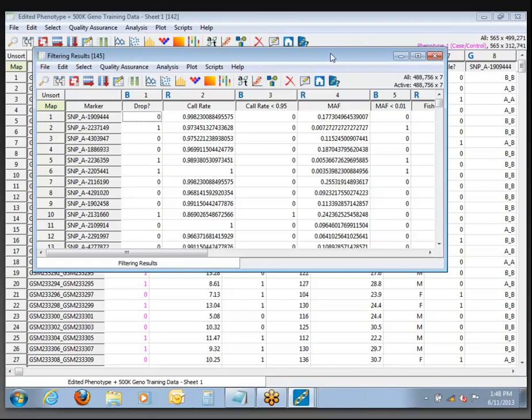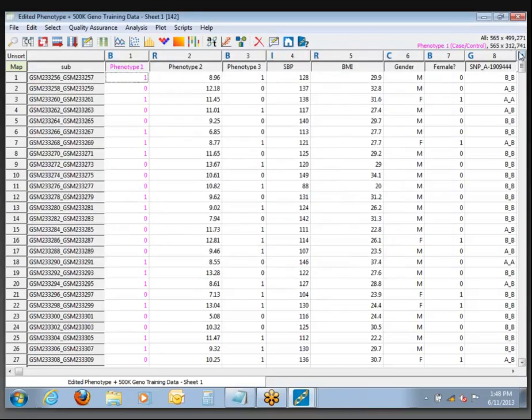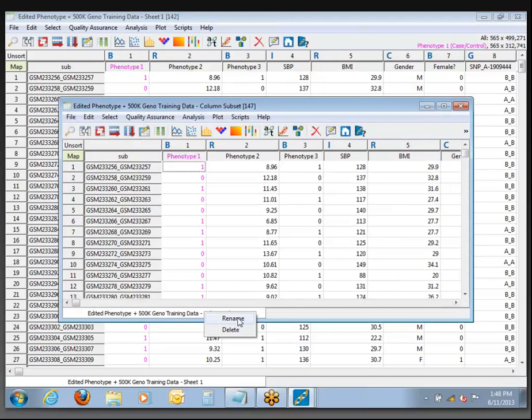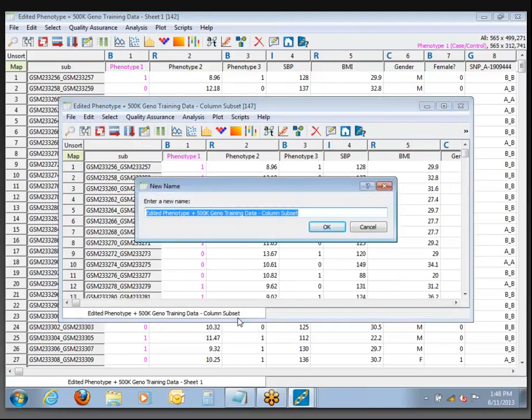We're just going to ignore the fact that we've got Asians and African Americans in here for now and just run with it. Just like before, we get our Filtering Results output. We see there are 312,000 columns that remain active now after doing the filtering a little bit differently — we get more data left to work with. I'm going to subset this one last time and call it 'filtered SNPs for analysis'.